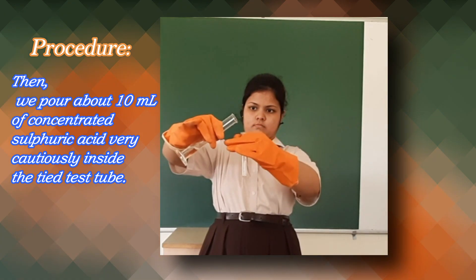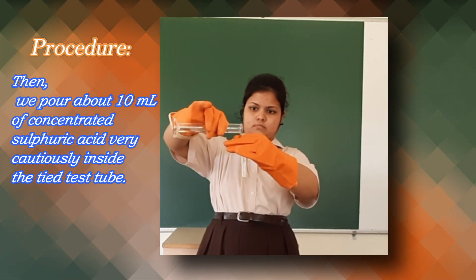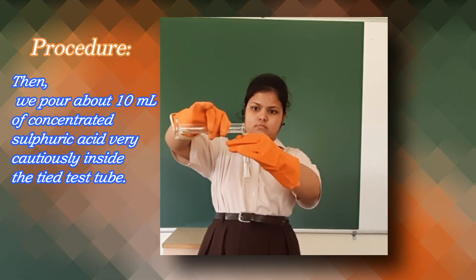Then we pour about 10ml of concentrated sulphuric acid very cautiously inside the tied test tube.